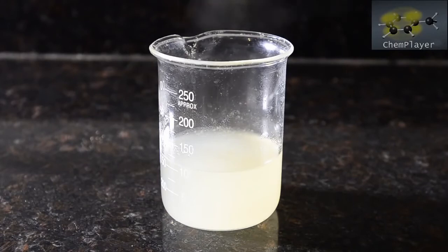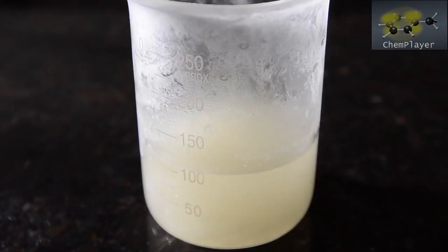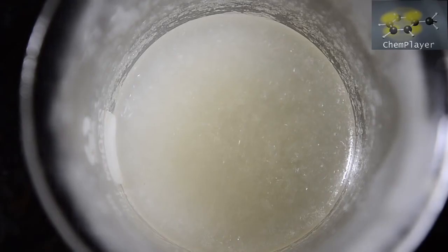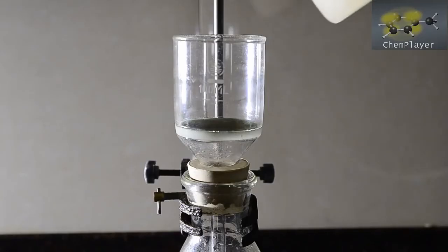Here's our hot solution. We're going to let this cool down slowly, and then chill it down in order to crystallize the benzilic acid in the solution. As it cools, sparkling white crystals appear in the mixture. We let this chill out for a while and then set up for filtration one last time.